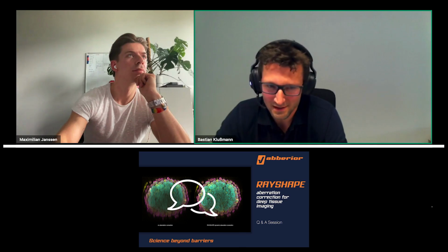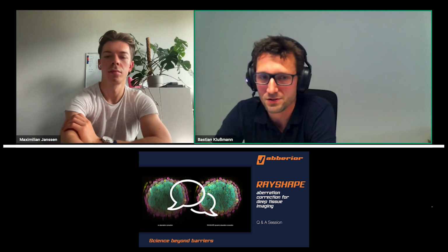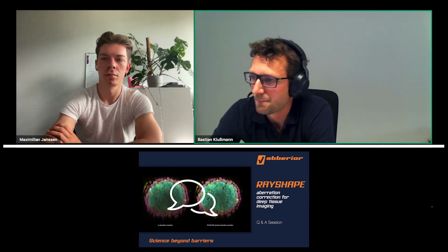Okay, then to the next question. Can we export the images in XZ or YZ position? And if yes, how? So I take an easy one. Of course, we can. First, we can acquire images in that way. We can make one single scan in one section. Nearly all the images I showed during my talk were XZ sections, and you can just acquire them that way and export them like any other image. Furthermore, if you acquire a volume, you can export the whole volume. And if you do 3D STED, you have an isotropic resolution, and can later export individual images by reslicing the image stack, for example. That is also possible.